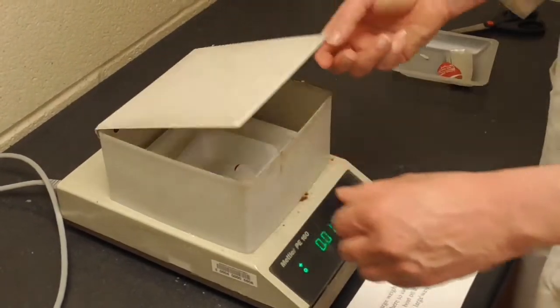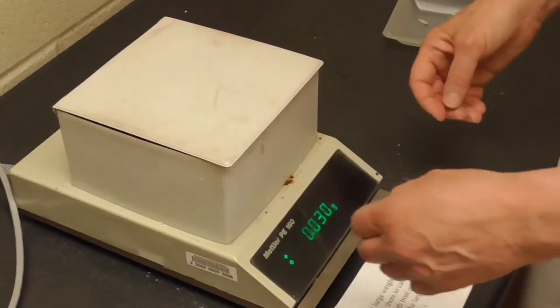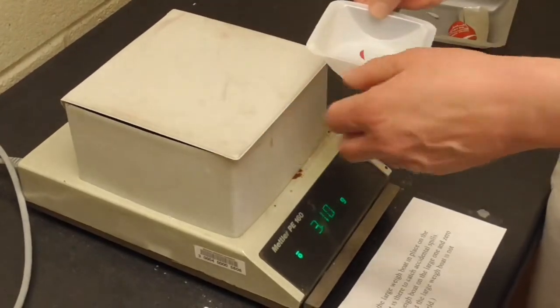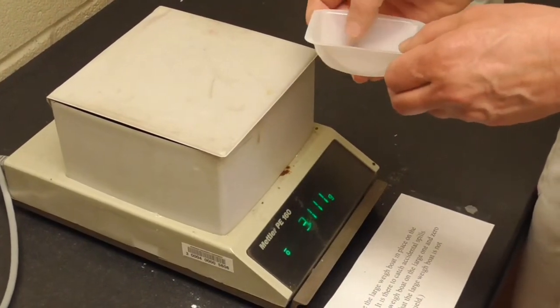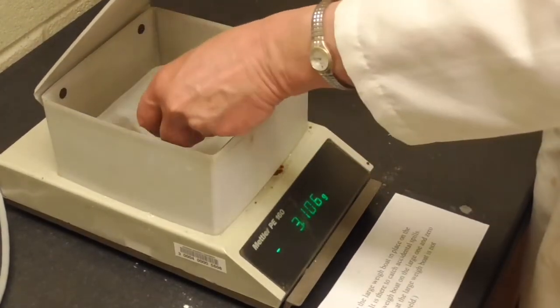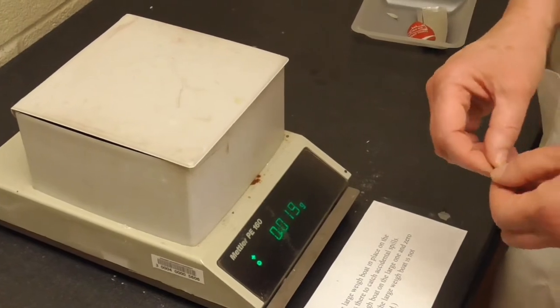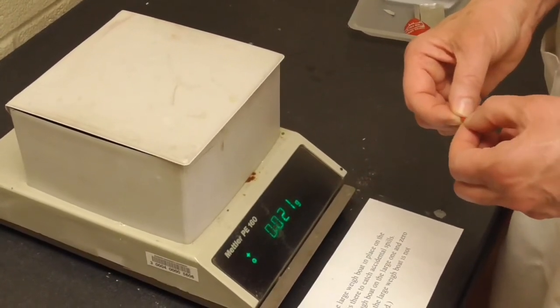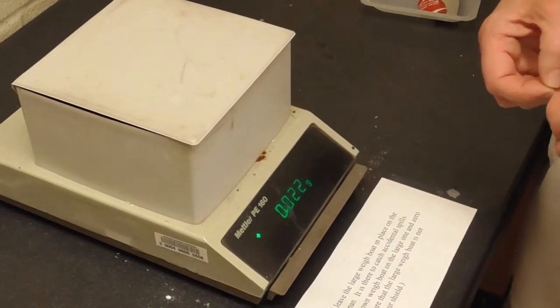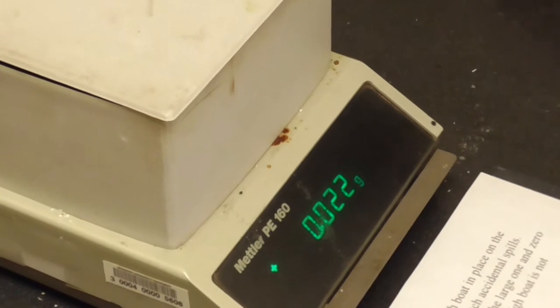I've got several pieces here, and it looks like it's a little bit too much, so I'm going to carefully take one out. The reason why I don't want it to be more than 0.025 is because if I generate too much gas in the apparatus, I won't be able to measure it appropriately. So that is the mass that we can use.